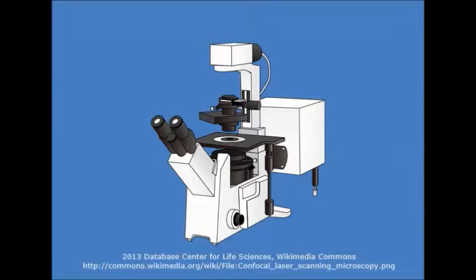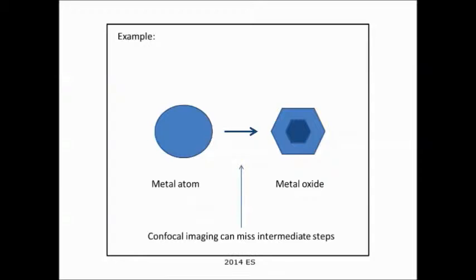While confocal microscopy has great advantages, there are some trade-offs. It is time-consuming to raster scan, and the process will take longer depending on the size of the sample. Therefore, you may not be able to image a process that is happening quickly.